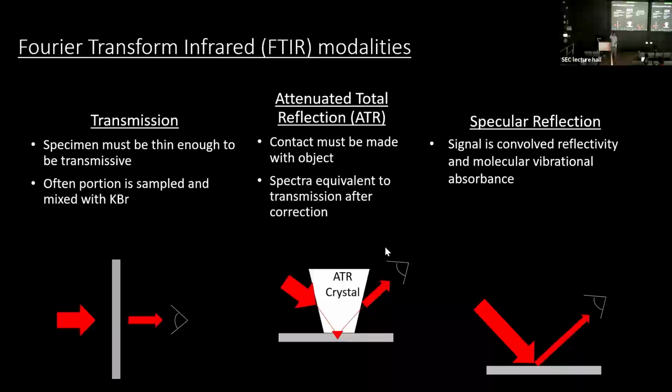But for most practical applications that you're going to use the FTIR crystal for, it's not going to matter the material so much. Diamond has become popular because it's fairly robust and holds up well in a shared use lab. Germanium has a higher index of refraction, so it penetrates less, and so it's a little more surface. But really, if you are interested in surface chemistry, there are other techniques we have that will get you much more surface specific.